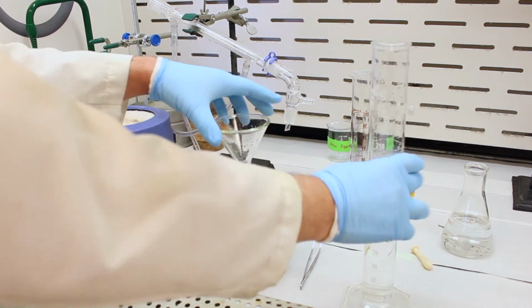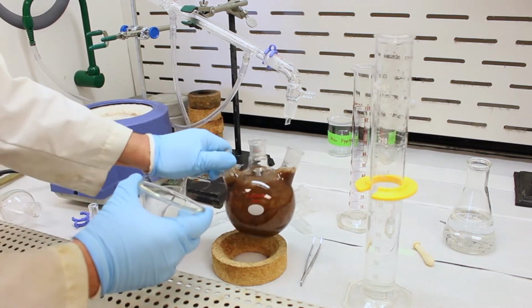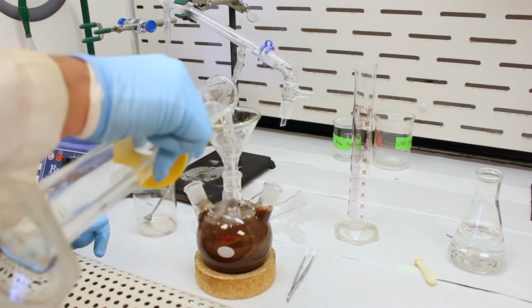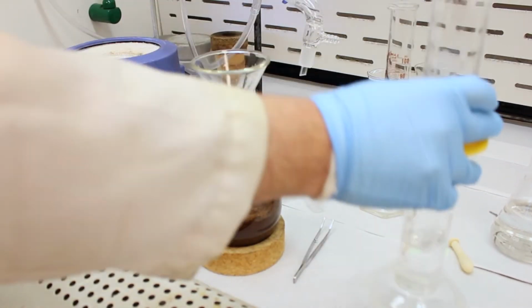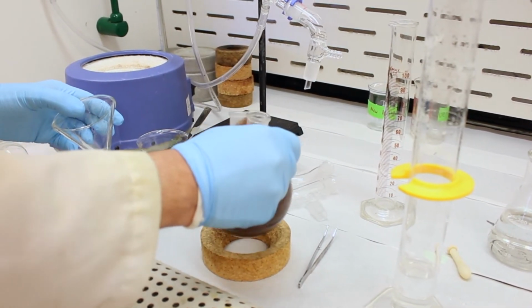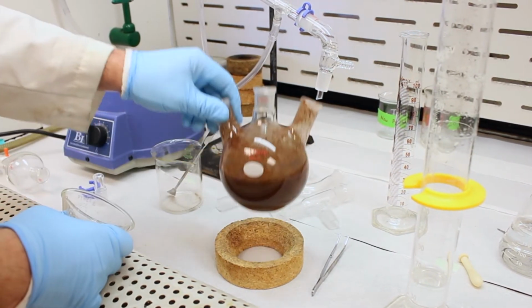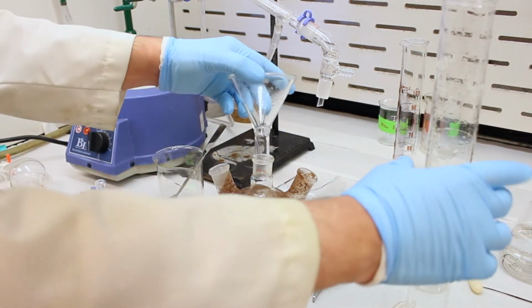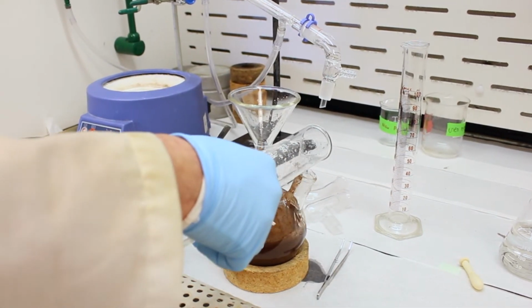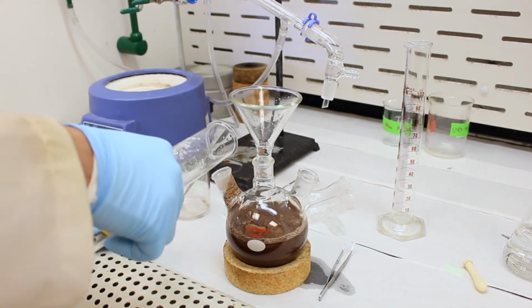So we'll add a little bit and make sure we don't overfill the flask. So you can see already it's quite a bit. Kind of looks like coffee grounds in water. And we'll swirl it around just to make sure all the allspice is coated and wetted by the water. And I think we're gonna stick it at that. So we added about 200 mils. Maybe we'll add a little bit more. In fact, we want to wash the sides down here, make sure it's not on the joint. There we go. Maybe add a little bit here.